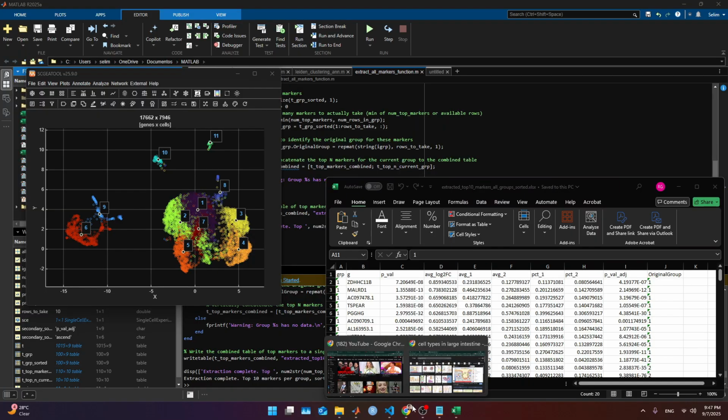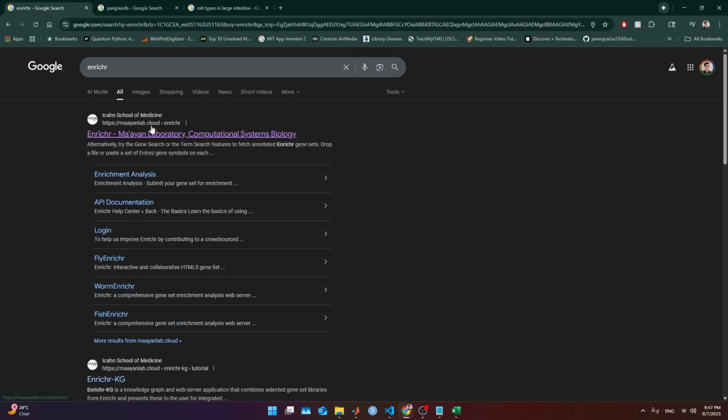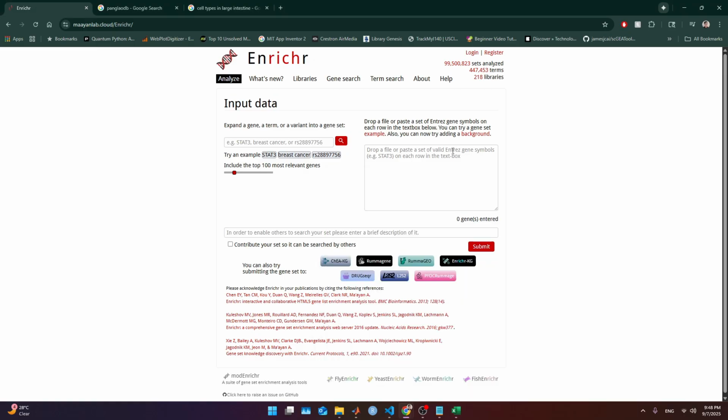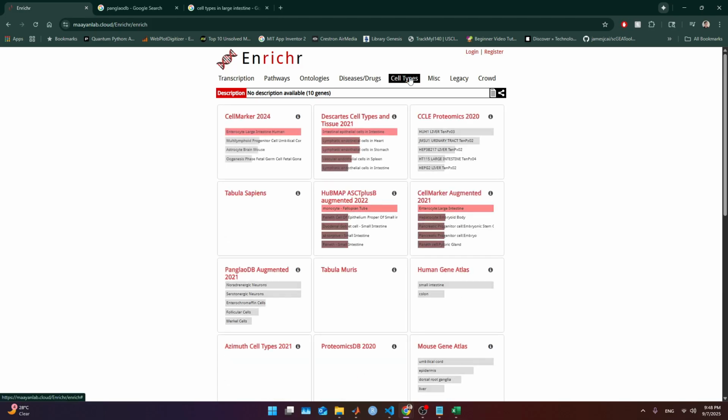And the third is gonna be having this website. And we are gonna do a few things here. Again, our website Enrichr, and we are gonna start asking Enrichr not only PanglaoDB. PanglaoDB is also here in this database, but we're gonna feed the top 10 markers and just submit. And we are gonna look for cell types.